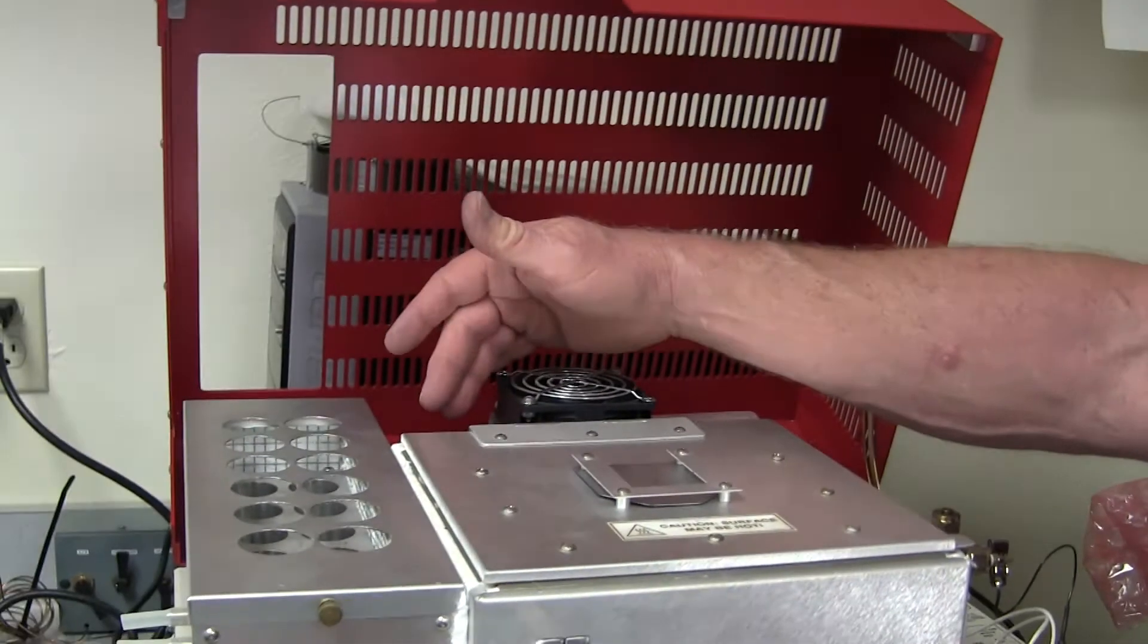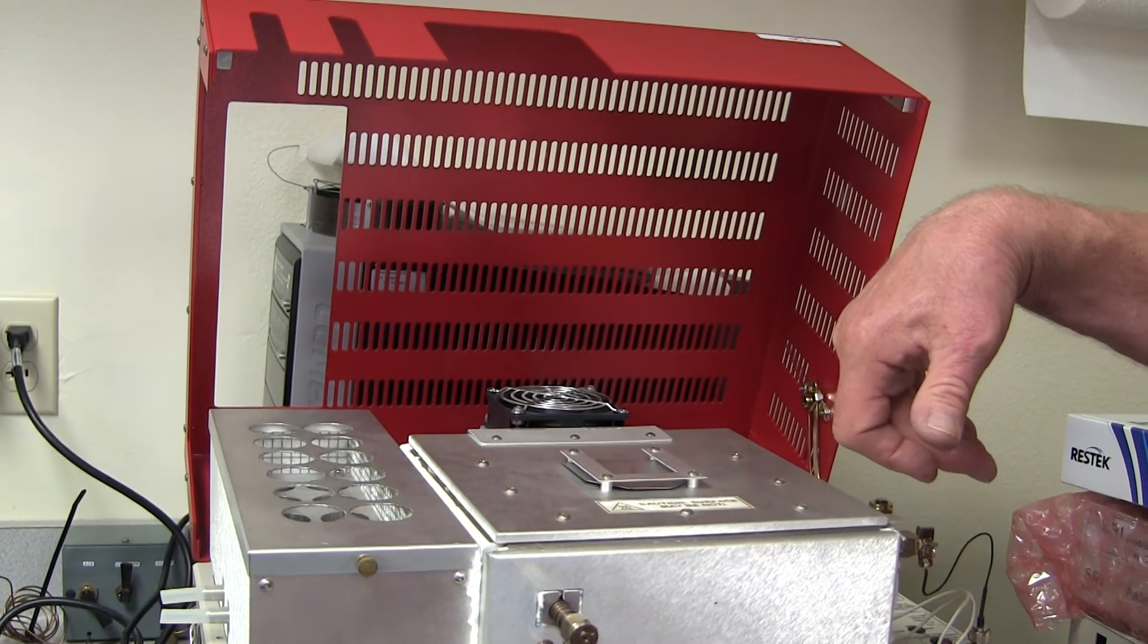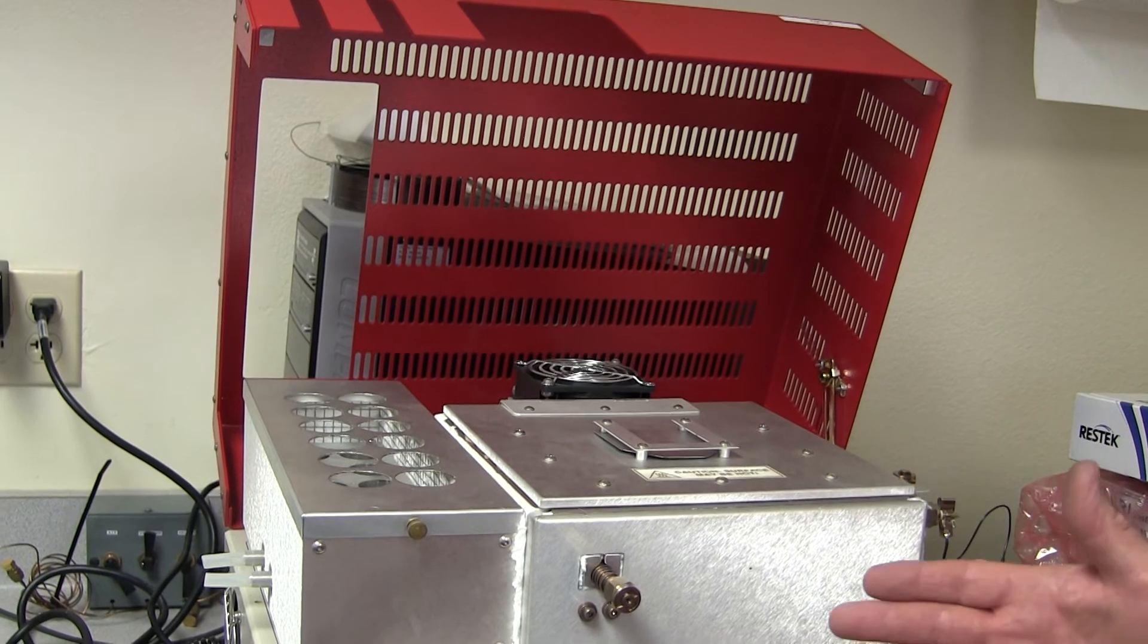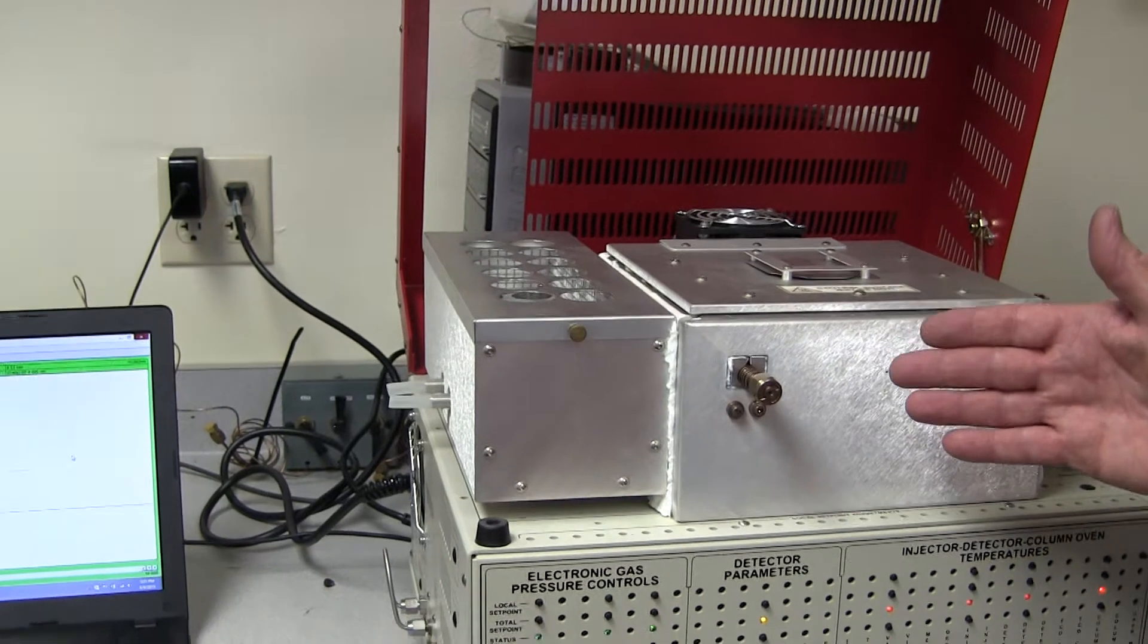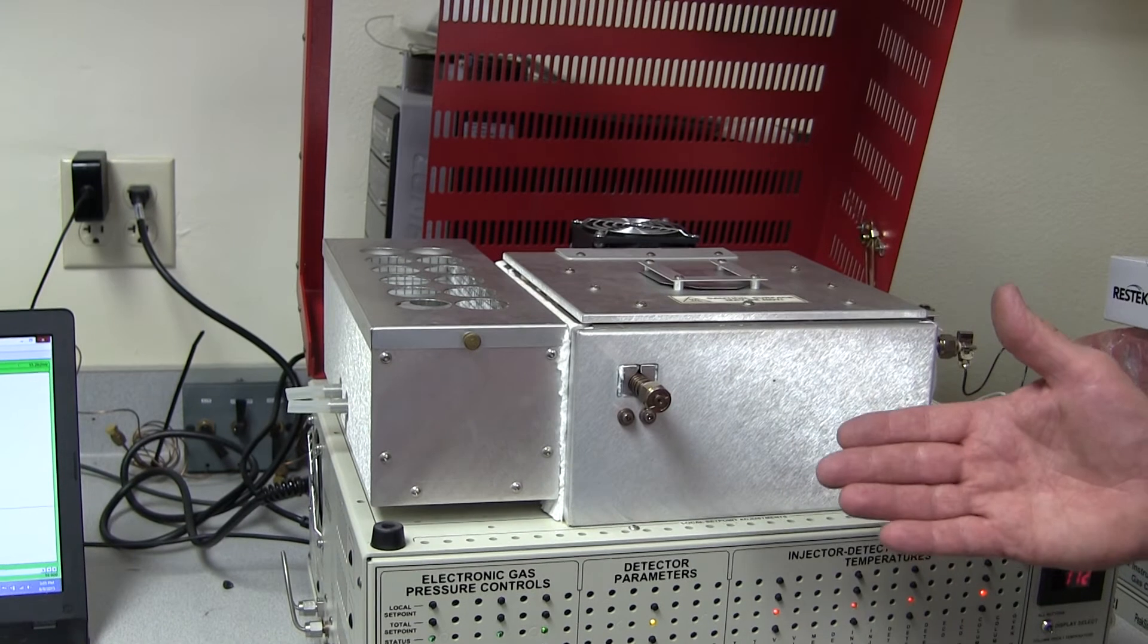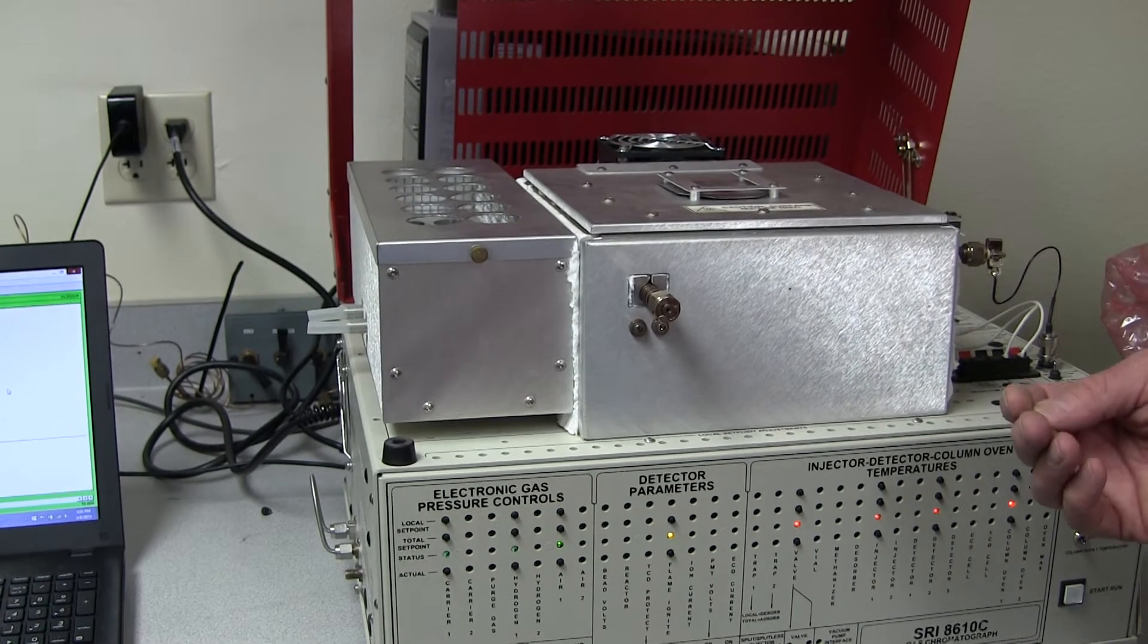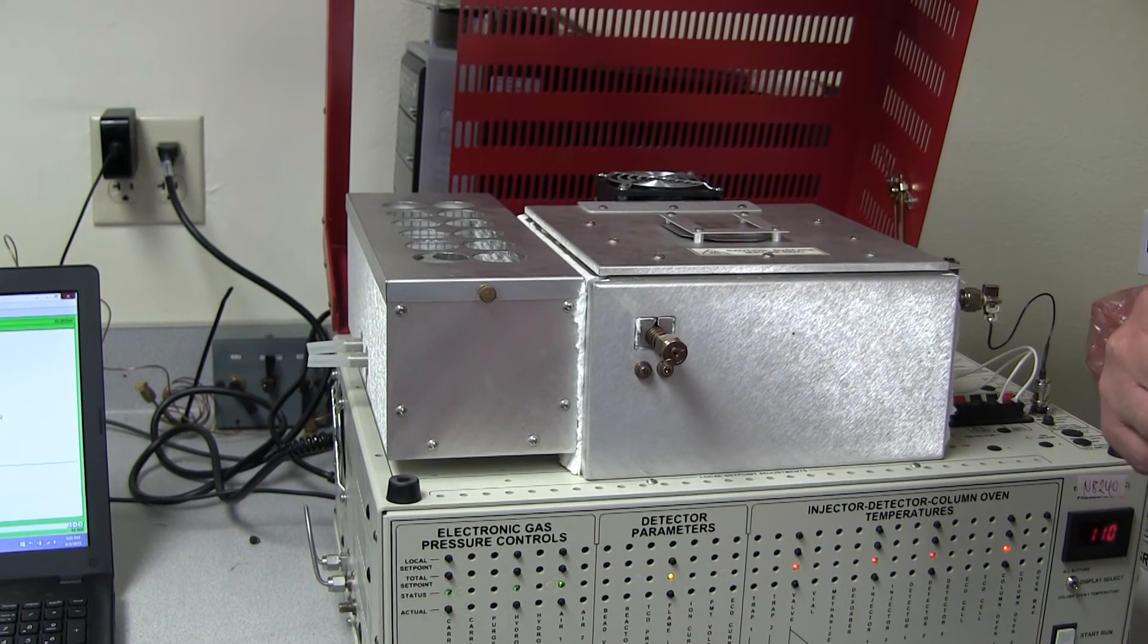The contaminants that are baked out of that little polishing filter go the same path as the carrier gas would normally go. So that means it would go through the column and end up at the detector. This is both a good thing and a bad thing. The good thing is that if you have the column and the detector that can see the contamination, you can assess how much contamination there really was in the filter. That's useful to know so that you can schedule a repeat bakeout in a week or two, depending on how big the peak is. Let's go look and see what that kind of a peak looks like.